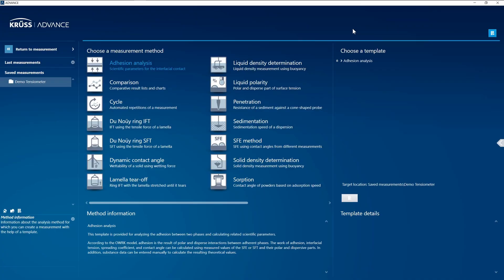And now we come to Advance. So anybody that already has a Kruse instrument will be familiar with this software. We use the same base software for all of our instruments. And if we look here on the home screen, we can see all the different kinds of measurement methods that are available for specifically this Tensio I have here.